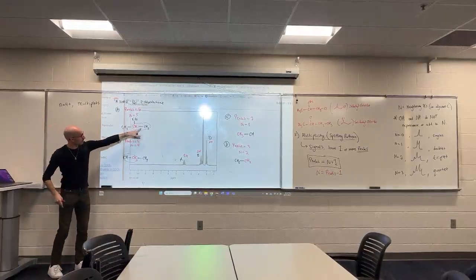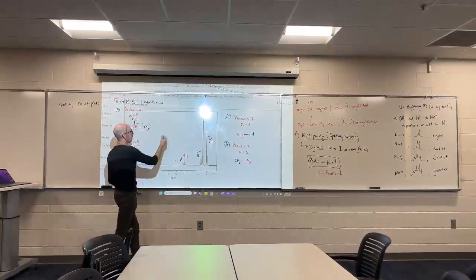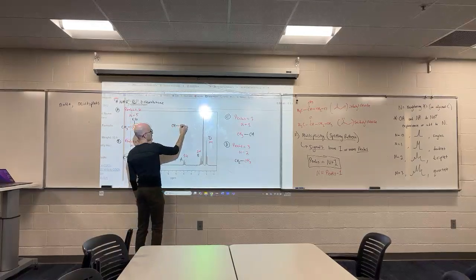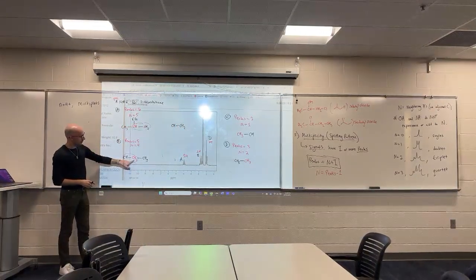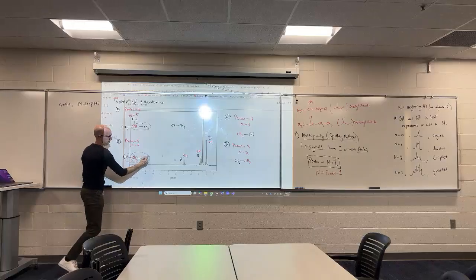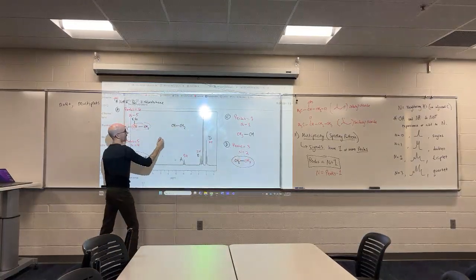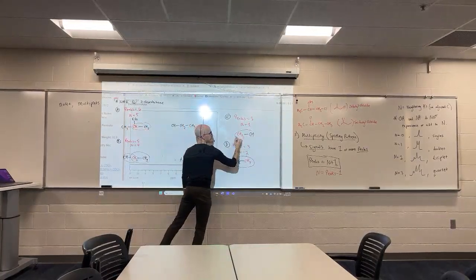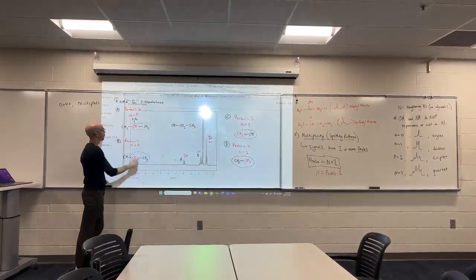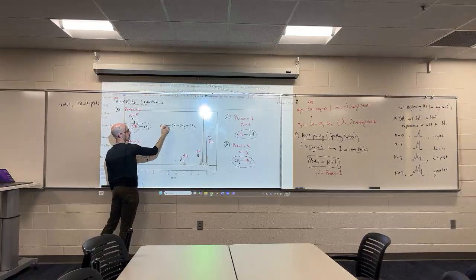So we said these pieces overlap. So I know I have a CH2. Now it turns out this piece overlaps with this piece. So I know I have a CH2 to CH3. And this piece overlaps with this piece. So I have a CH3.